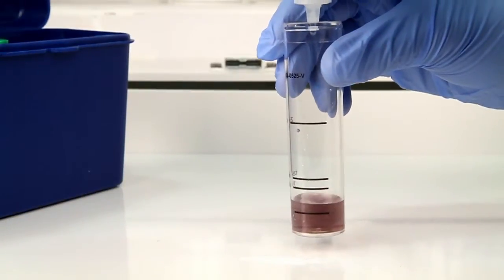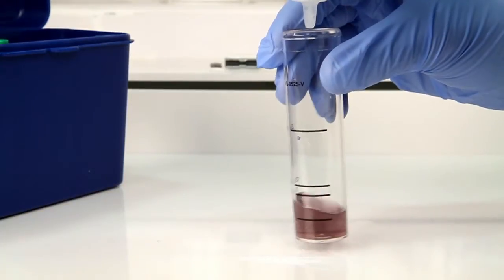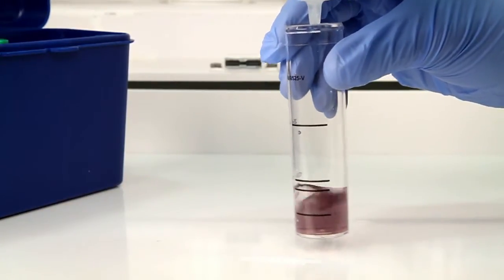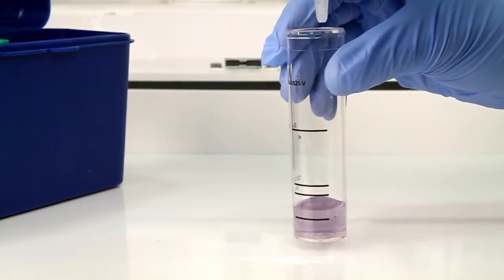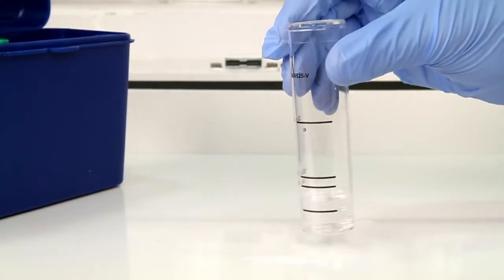After the addition of each drop of titrant, swirl the vial to make sure the sample is properly mixed. Count the number of drops during this step. The titration is complete when the sample turns from blue-black to colorless.